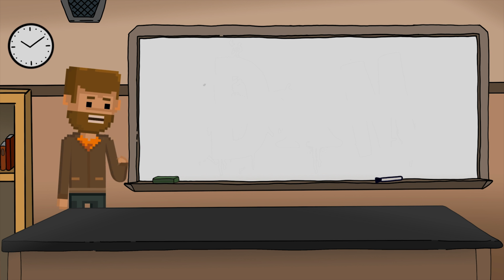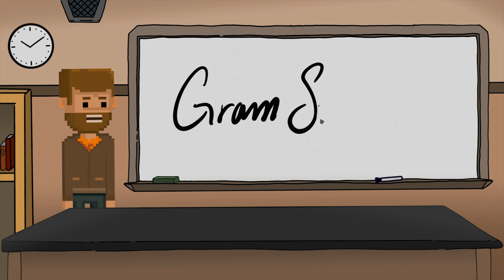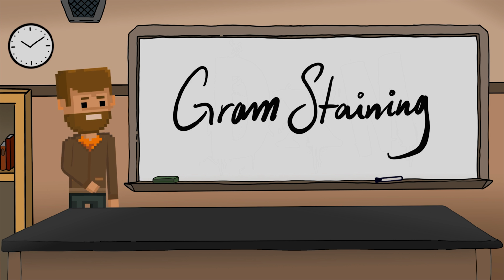Hello everyone. Today's DXM is all about gram staining. We're making this video because gram staining deals with quite a few steps and it might get a little confusing. But it's something you'll definitely want to learn because you'll be doing it a few times throughout the semester. In fact, it's pretty much the first step taken in the process of identifying an unknown bacterium.